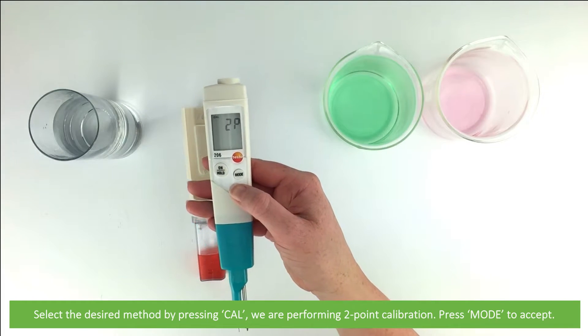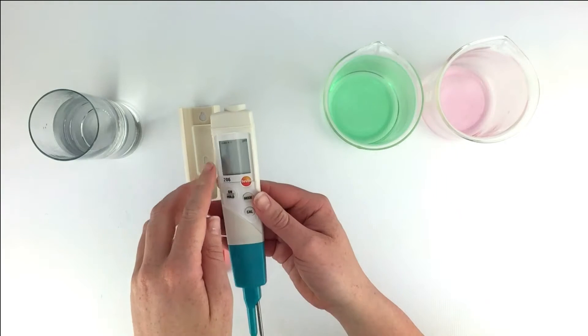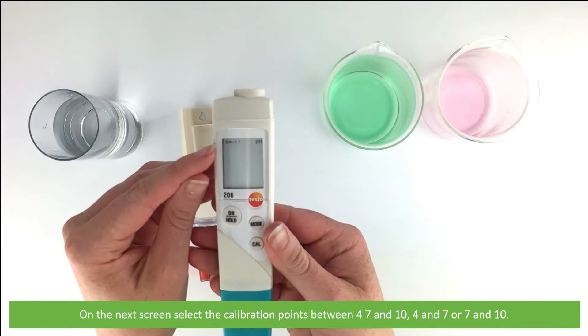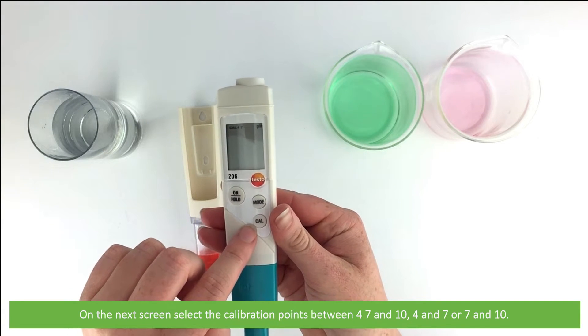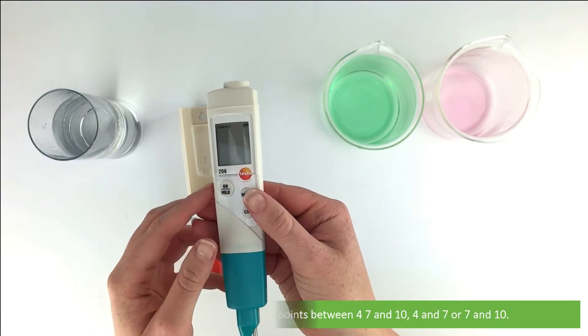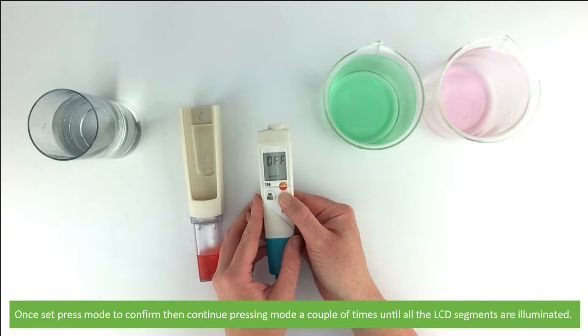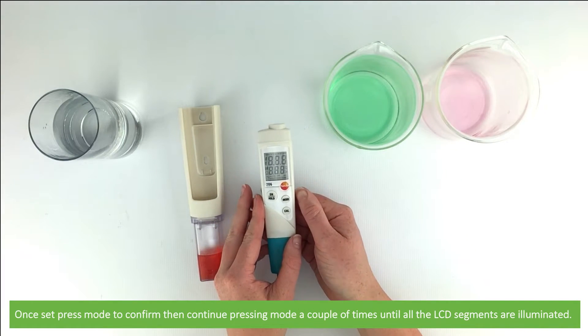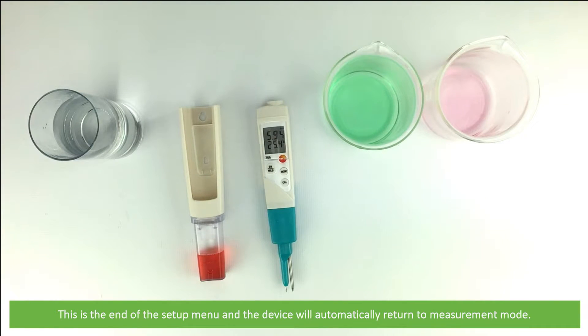We are performing a two point calibration so we'll press mode to accept. On the next screen, select the calibration points between 4, 7, or 10 — that is 4 and 7, or 7 and 10. We will select 4 and 7. Once set, press mode to confirm, then continue pressing mode a couple of times until all the LCD segments are illuminated. This is the end of the setup menu and the device will automatically return to measurement mode.